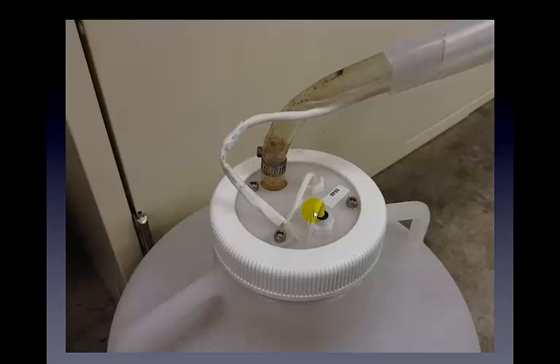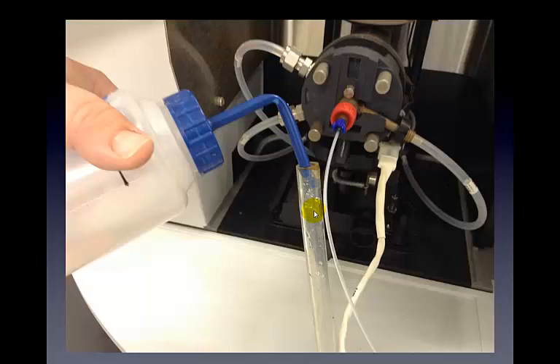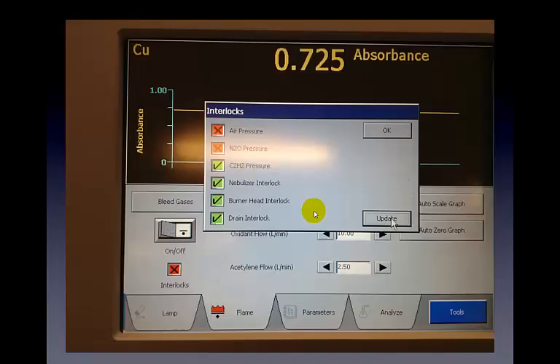The other common error is the drain interlock. The waste container has its own safety interlocks built in, with wires going down to the waste carboy. Sometimes the probe sensing liquid in the waste container dries out, giving a drain interlock error. The fix is to pull off the waste tube and squirt some water into it until the interlock error goes away. Once modifications are made, click the update button — the nebulizer and drain interlocks should now be fixed. Any remaining air pressure issue typically resolves on its own when you try to start the instrument.